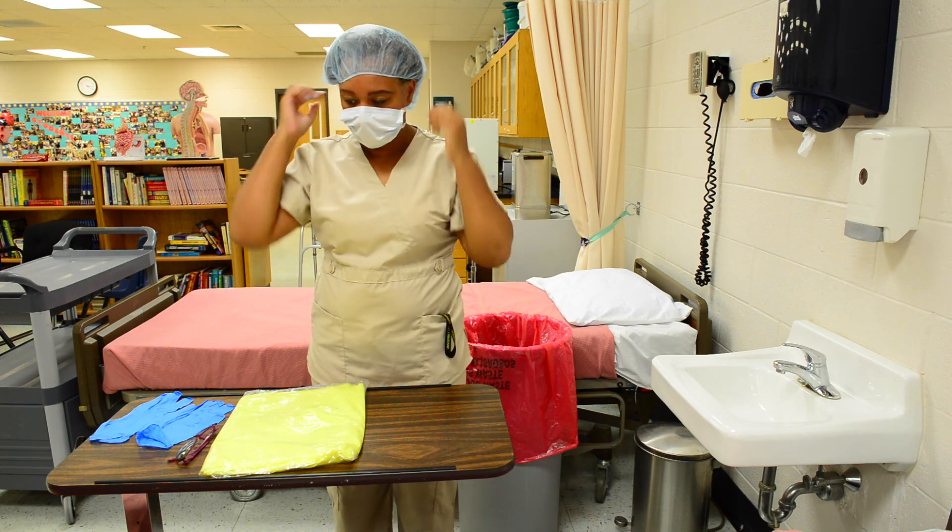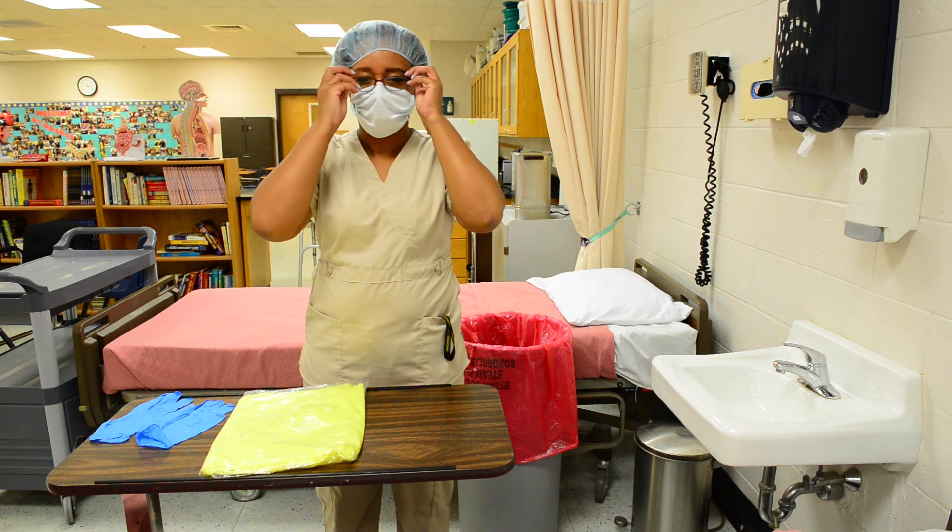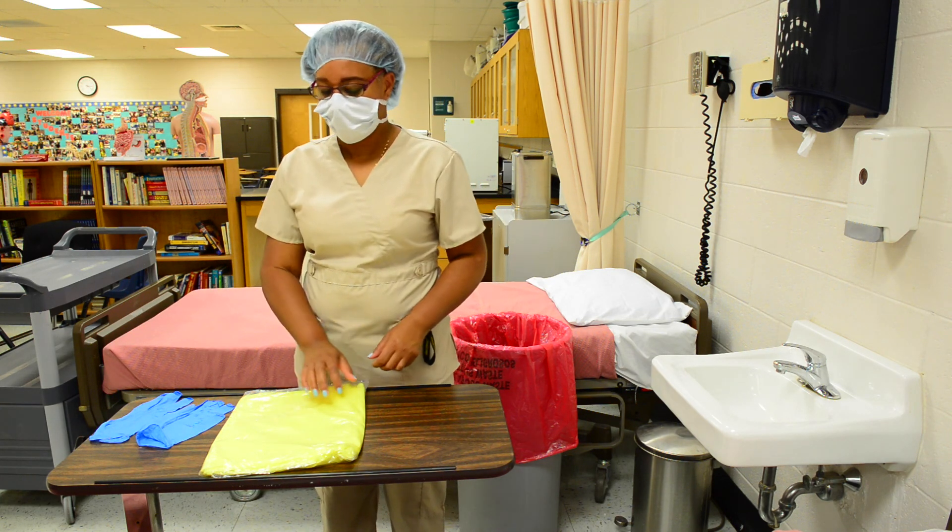Put on your safety goggles or safety glasses. Put on gown correctly.